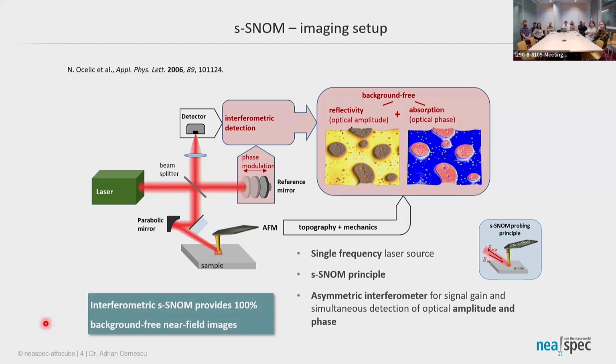This is a background free image. The scan size is 5 by 4 micrometers.